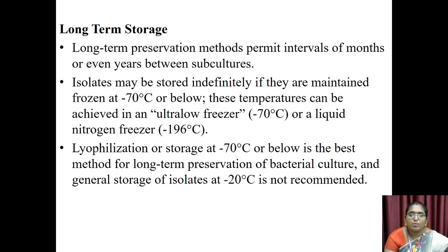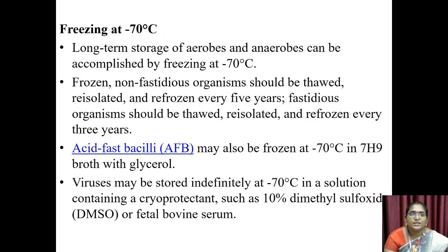Lyophilization or storage at minus 70 degrees Celsius or below is the best method for long-term preservation of bacterial culture, and general storage of isolates at minus 20 degrees Celsius is not recommended. Freezing at minus 70 degrees Celsius. Long-term storage of aerobes and anaerobes can be accomplished by freezing at minus 70 degrees Celsius.